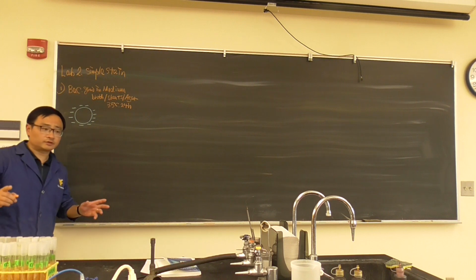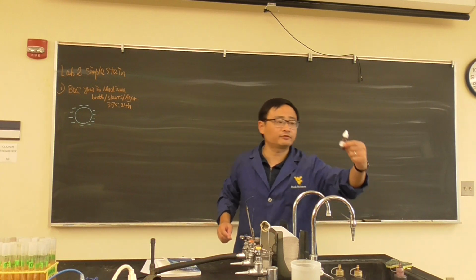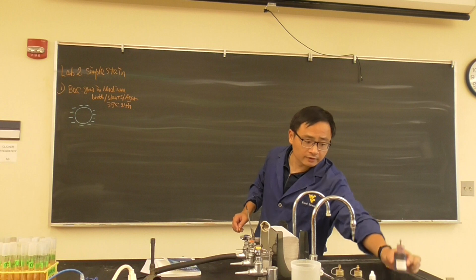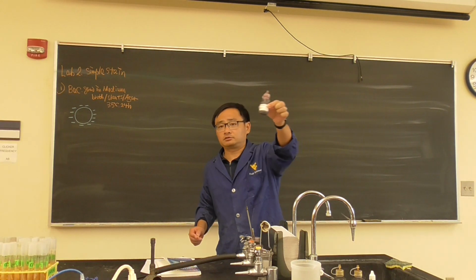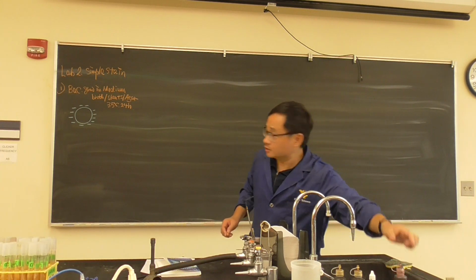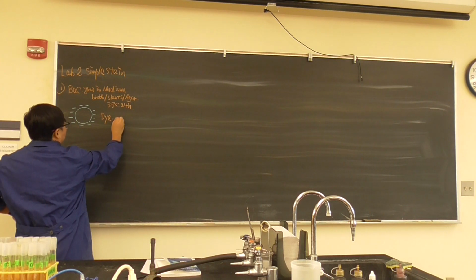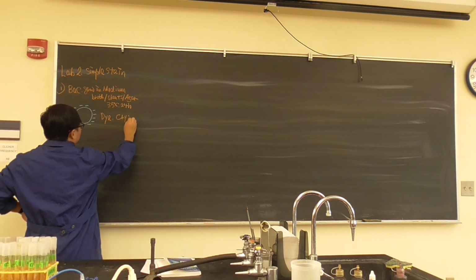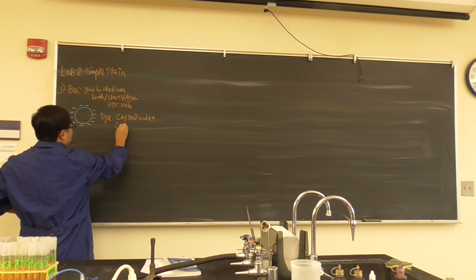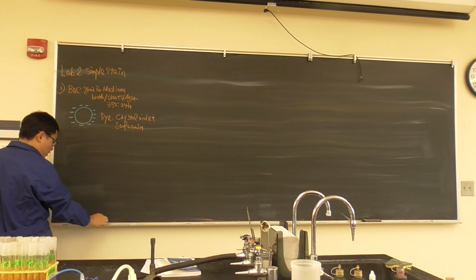And then we have a different type of chemical, which we call a dye. For example, you have this very purple one, called crystal violet, and you have a red one, not really very red, a little bit pink red. It's called safranin, and those are the dyes. Crystal violet and safranin are positively charged.